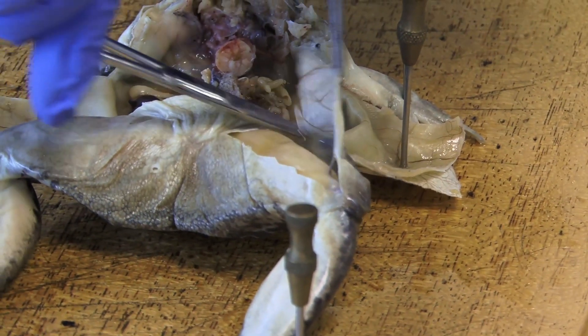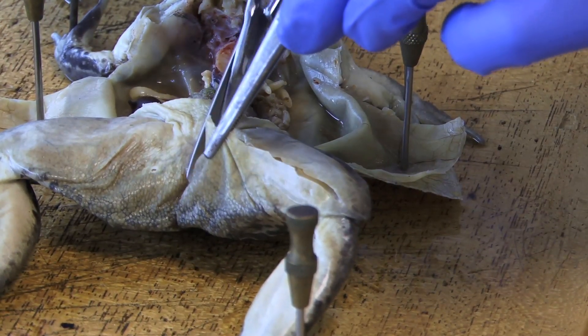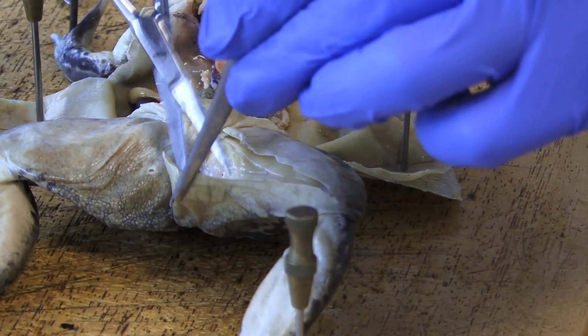We can do a T-incision — that's fine — a T-incision on this side as well. I'll connect your tissue there.